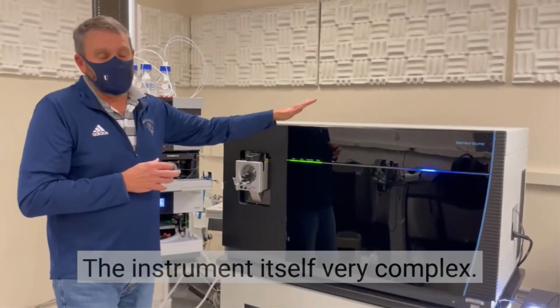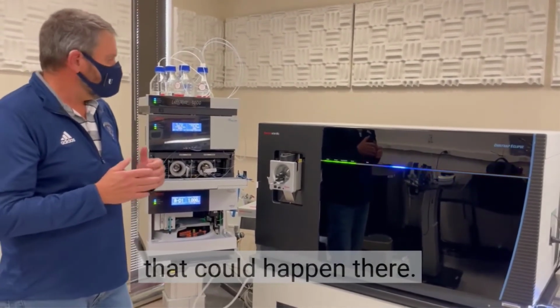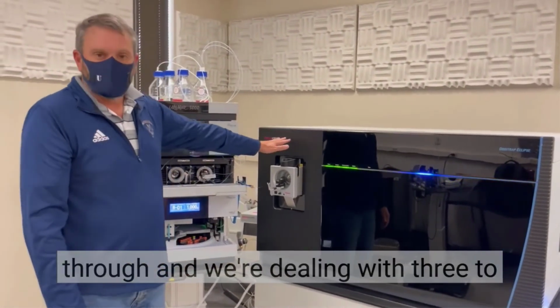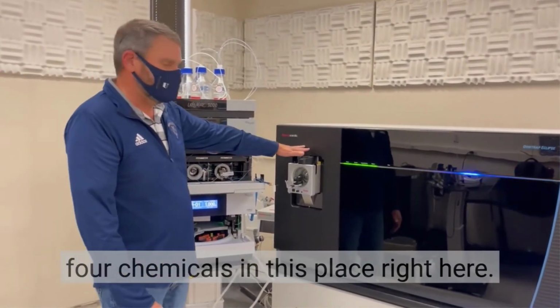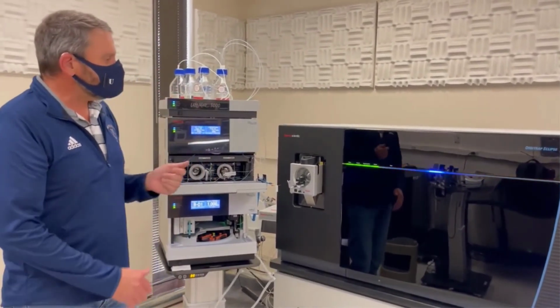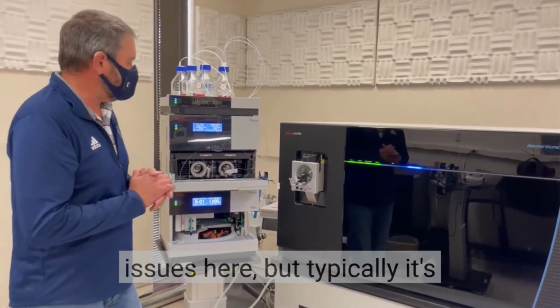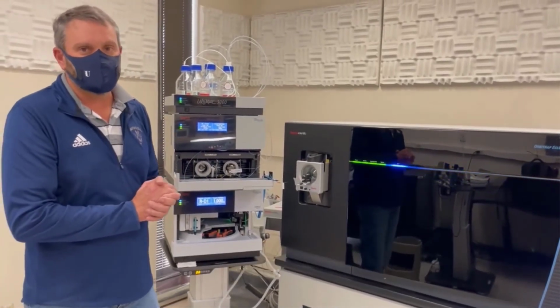The instrument itself is very complex, so there's always an issue that could happen there. We're dealing with liquid coming through, and we're dealing with 3 to 4 kilovolts in this place right here. So we always have some issues here, but typically it's the LC.